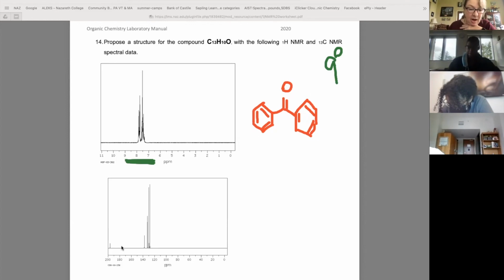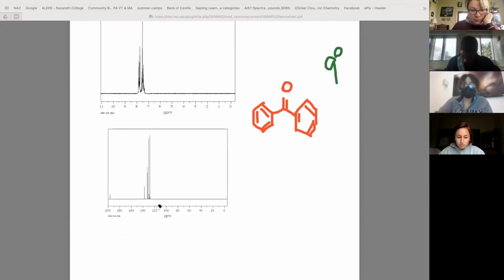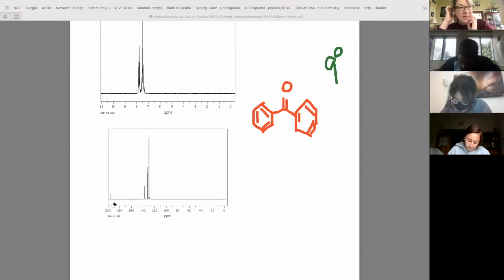Let's look at the carbon NMR. It shows what double bond? A whole bunch of stuff on the benzene, right? If you look at your table, between 120 and 140 is all the carbons that are in a benzene. But then there's this one up near 200. What does that one mean? There's a double bond, which is a carbonyl, between 200 and 150. The carbonyl, yep.